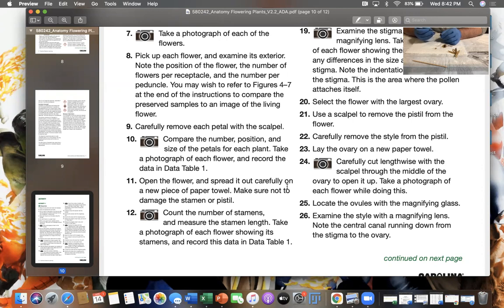The stamens are obvious because they're like these little T-bars that come up. I guess this is the actual stem top of the base. That's the ovary.